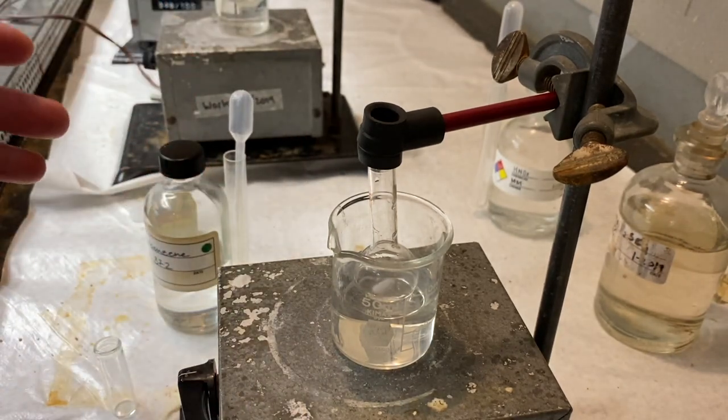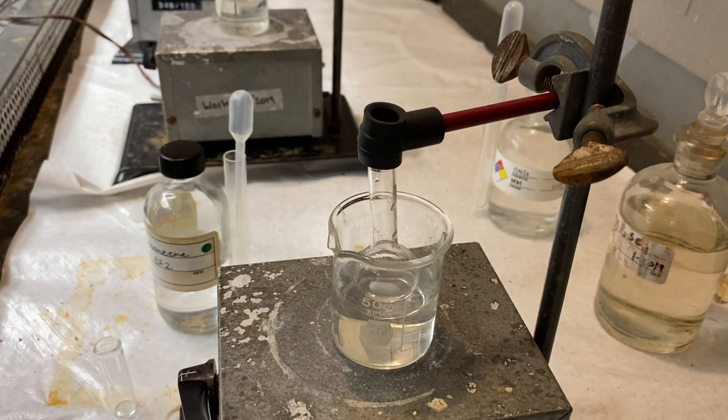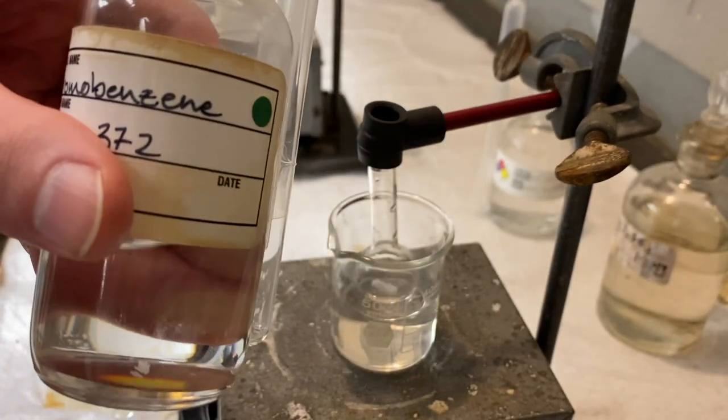When we're actually in lab and you're doing this with a lot of other people, I would suggest go ahead and grab what you need of the bromobenzene.